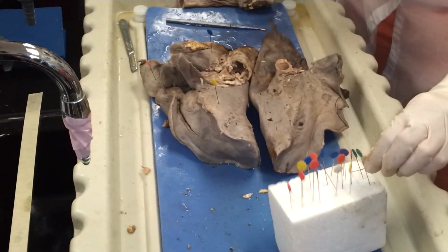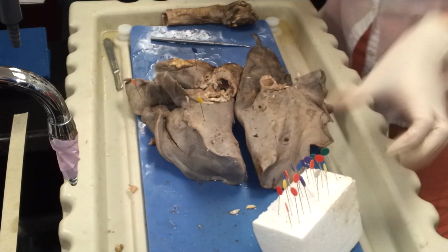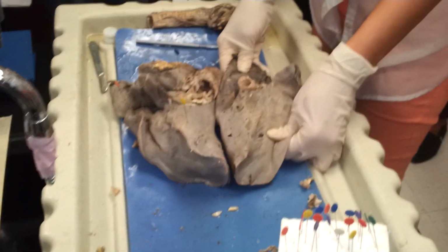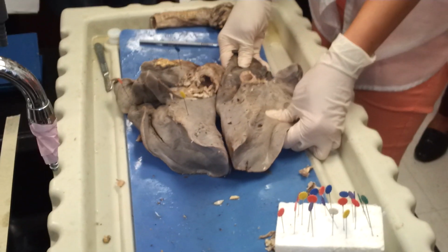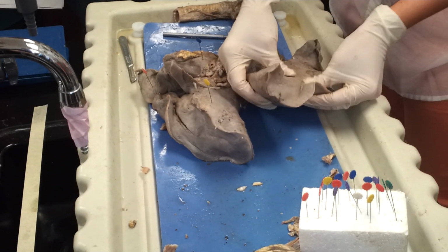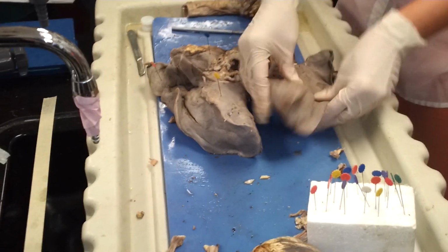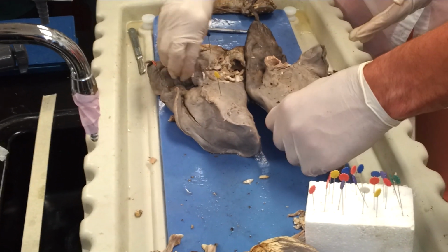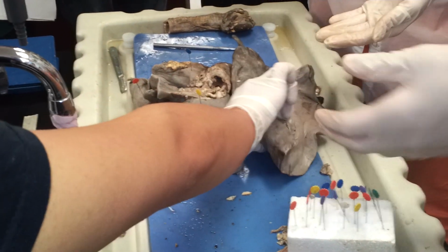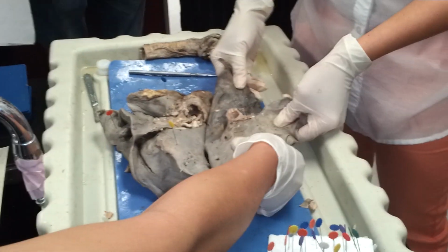Okay? And the reason why I told you to just leave your gloves on is because if you guys feel the lungs, remember yesterday I told you the lungs are like a sponge, right? So we're going to have a lot of residual volume. It's going to hold a lot of air. So if you feel it, it's really spongy and Tempur-Pedic bed-like. So I think it's the softest thing that we'll see. So if you guys want, put on a glove and feel the lungs. They're pretty cool.